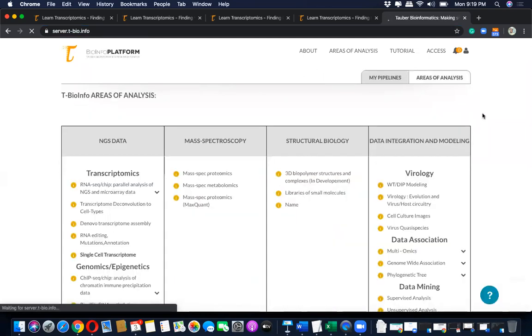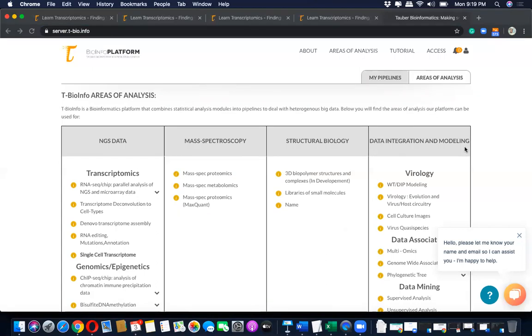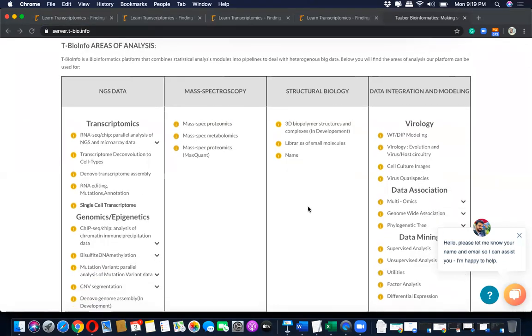Hi, Sarah. Thank you for joining. You're a little late though. And we are doing factor regression analysis together to give you an update.